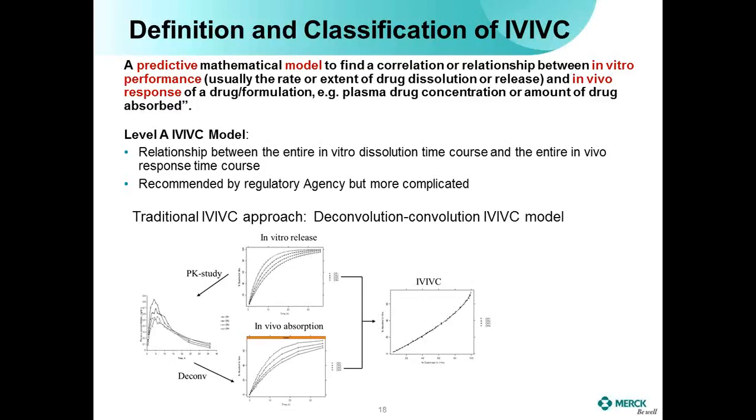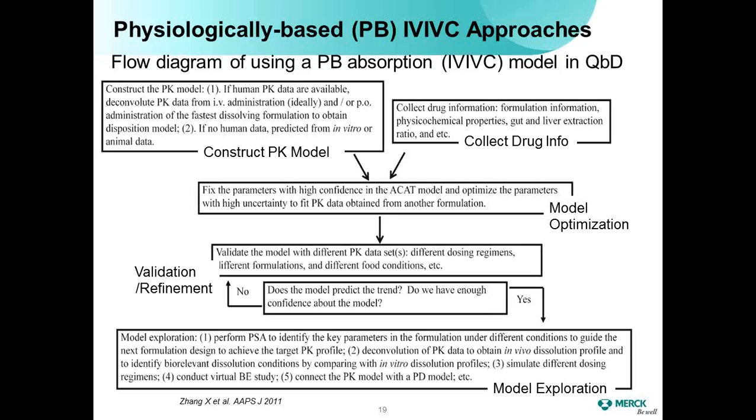However, we ended up having to use two stages of linear relationship, which means that we don't have a very nice linear correlation over the whole time period. So we have to split it into two stages of the model. So that would be more complicated to approach. That's why we thought about whether we can use some alternative approach to complete the IVIVC for this compound.